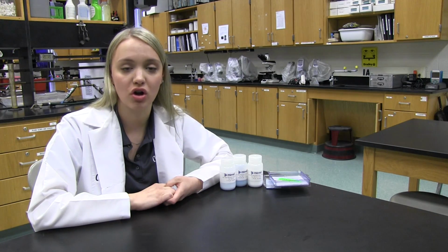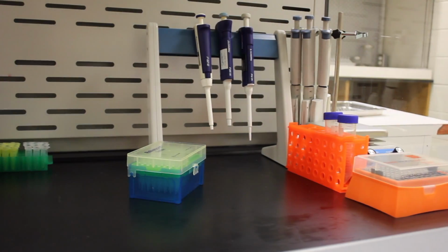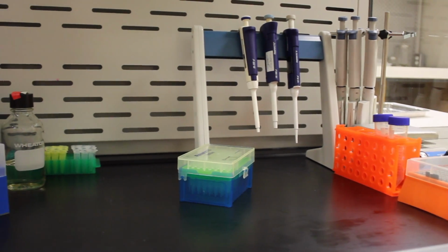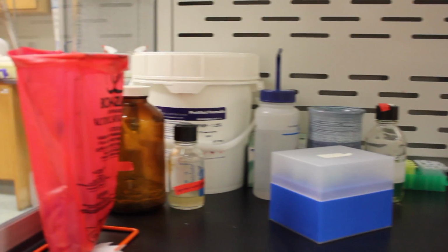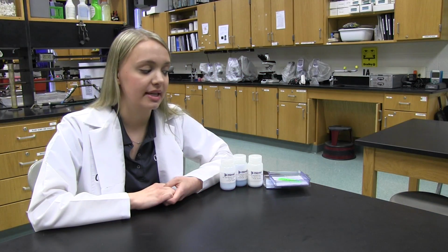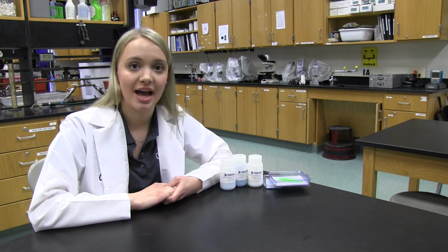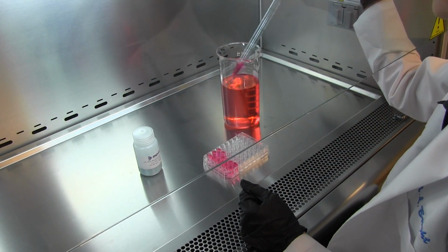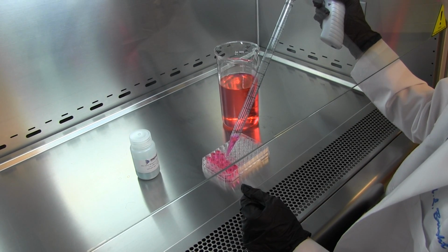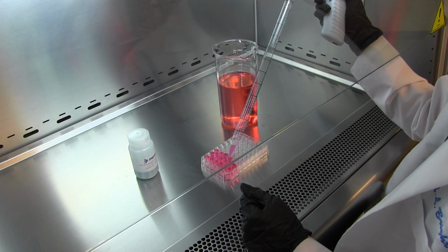And so I have been working with cell culturing on a fungus called Candida albicans, which causes yeast infections. And I have been testing borate-based bioactive glass to see if bioactive glass can be used as an antifungal. And with this research, I can then use my data to support that bioactive glass should be used in this bandage to prevent infections. So for the cell culturing, I tested a total of 3 types of bioactive glass.